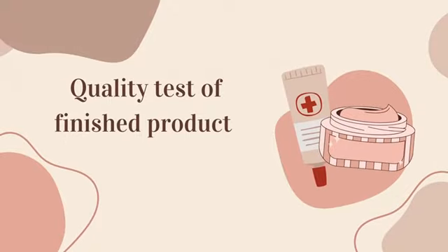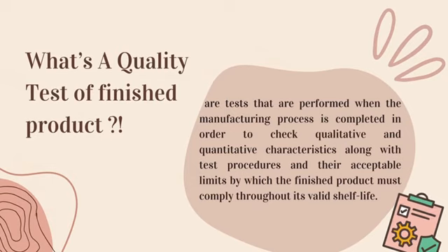Quality test of finished product. What is a quality test of finished product? These are tests that are performed when the manufacturing process is completed in order to check qualitative and quantitative characteristics along with test procedures and their acceptable limits by which the finished product must comply throughout its valid shelf life.